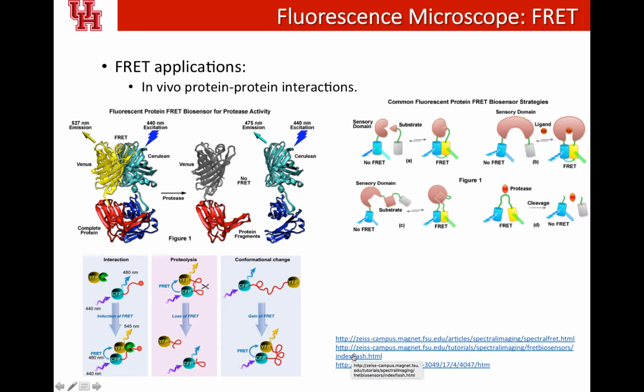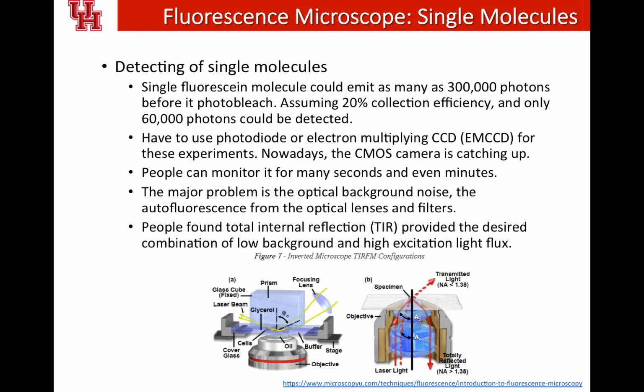Although I heard that some people told me FRET looks pretty easy, when you do it, it's not as easy as you think, because there are so many interactions, non-specific interactions. It's not as easy as the cartoon shows you.